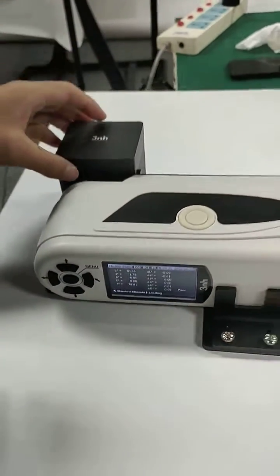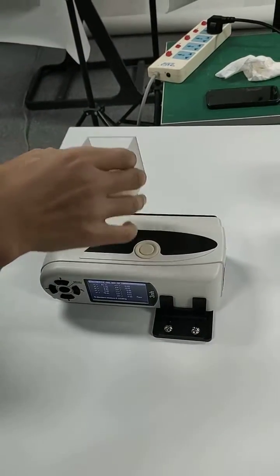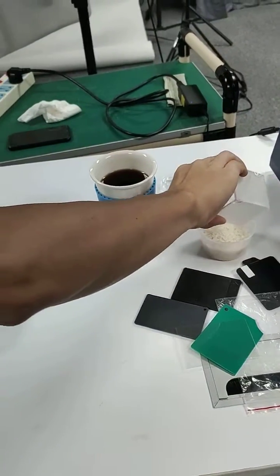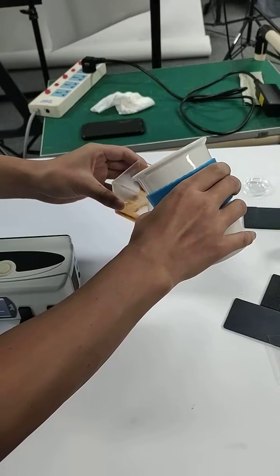The measurement of the liquid is almost the same. First, we get the sample ready. We pour the sample into the cuvette.